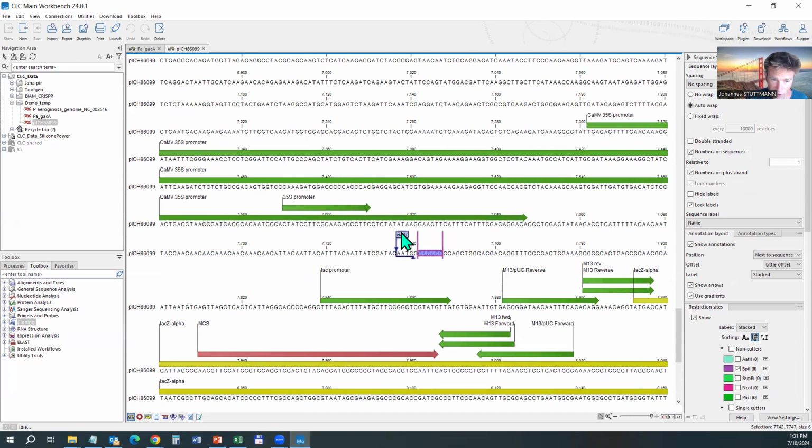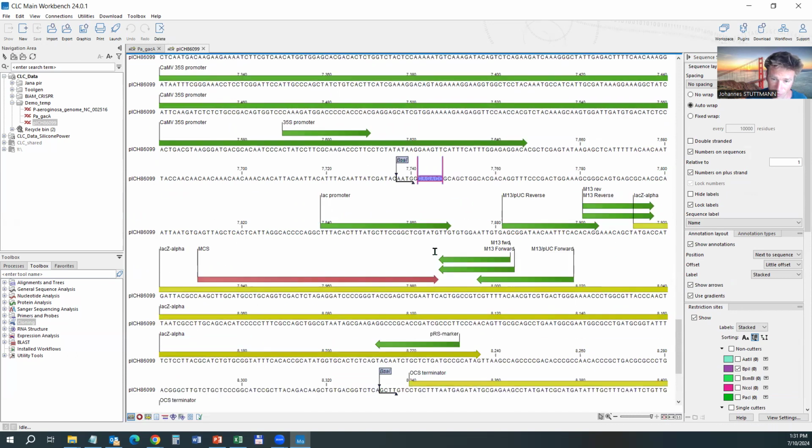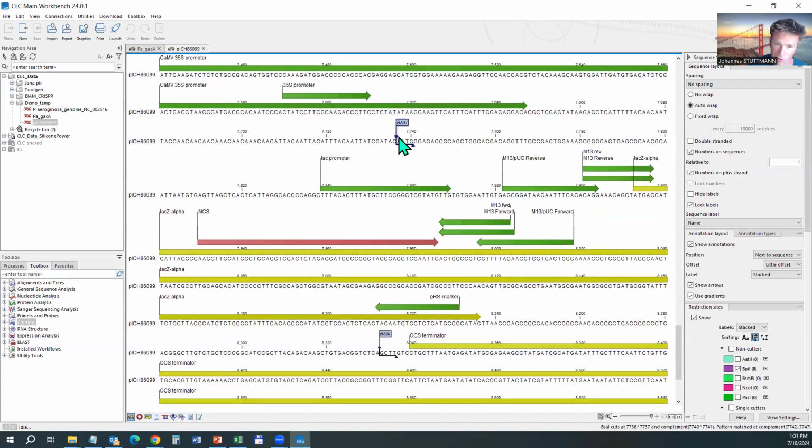So the beauty of Golden Gate cloning, as I said, is basically that the restriction sites are asymmetric and can be placed so that they are in one fragment or in the other fragment. So here, as I said, we want to replace this fragment that contains the marker gene, so the LacZ gene, by a gene of interest.